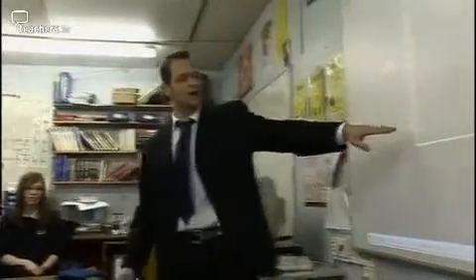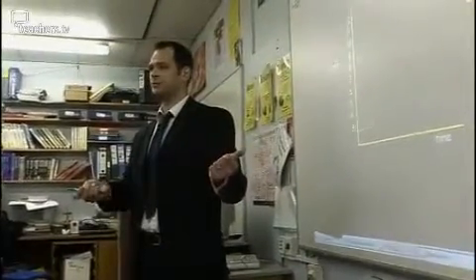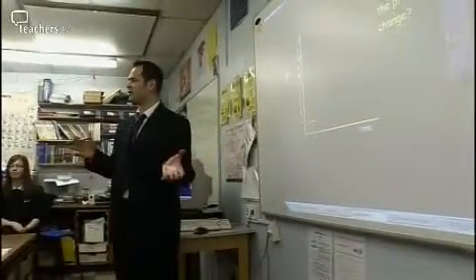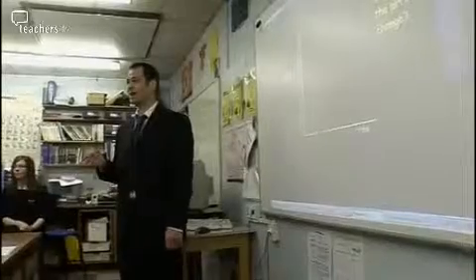Okay, so you'll find the pH will change, but is it going to go up? Is it going to go down? What's going to happen? It's going to go up. So the pH is actually going to go up. How do you think it's going to go up? Is anybody brave enough here to come up and have a squiggle on my board and actually predict what it might look like? Come on then, Caroline. Oh! Steady.